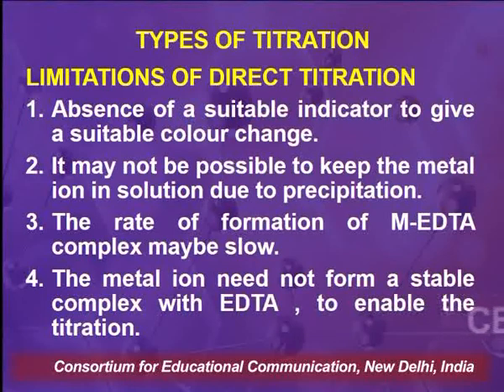So one doesn't know when the reaction is complete. Another limitation with respect to direct titration is that it may not be possible to keep the metal ion in solution due to precipitation. There might be some precipitating agent present in the solution which might precipitate the metal ion.